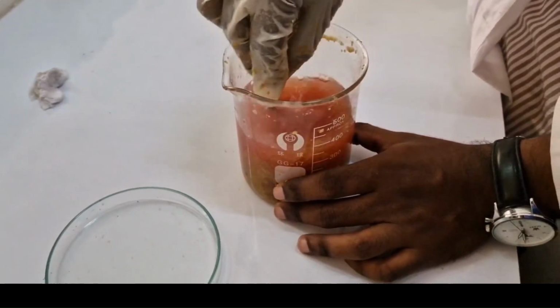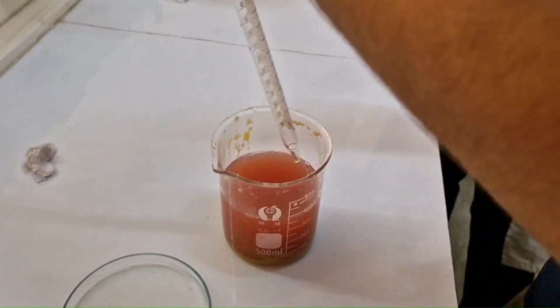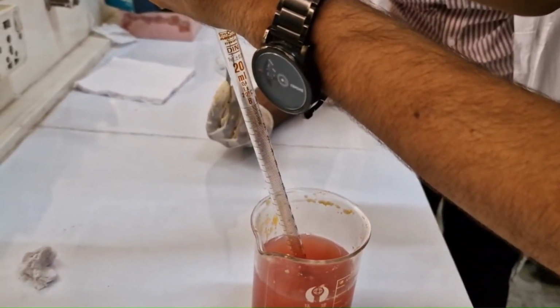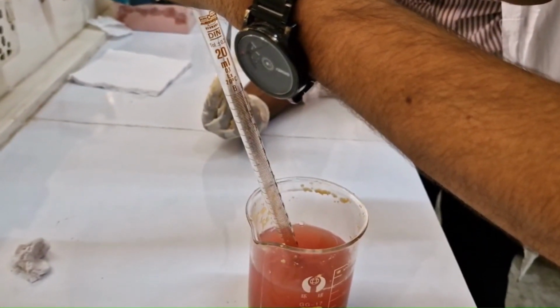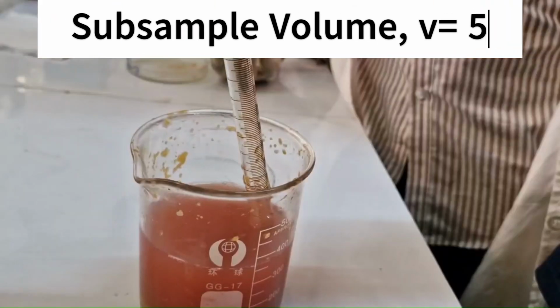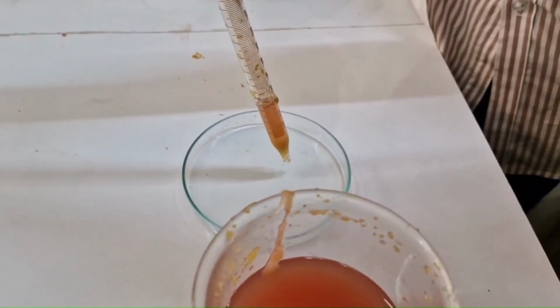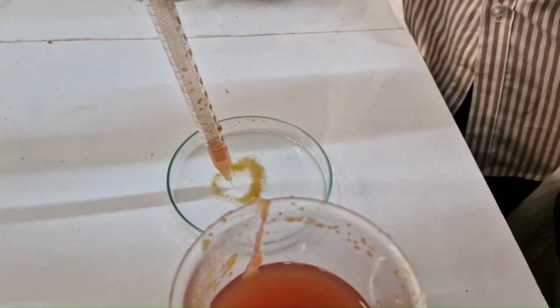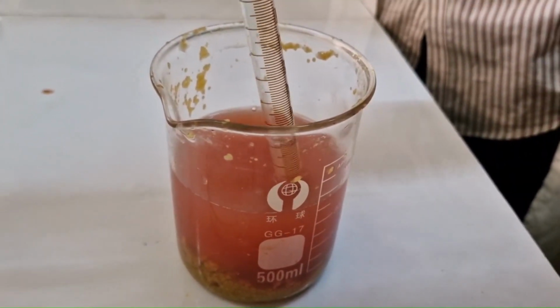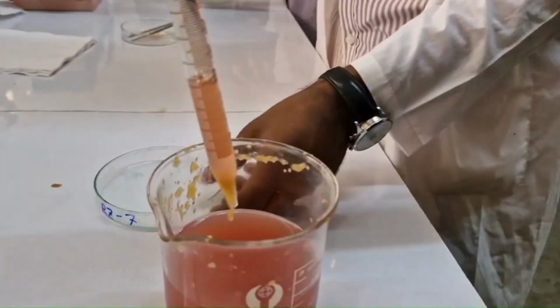Then we cleaned the pipette, rinsing with water. We took two subsamples from the solution by using the pipette, where the volume of each subsample was 5 ml. After taking the first subsample from the solution, we put it in a petri dish, which is subsample 1. Similarly, we took another subsample, which is subsample 2.